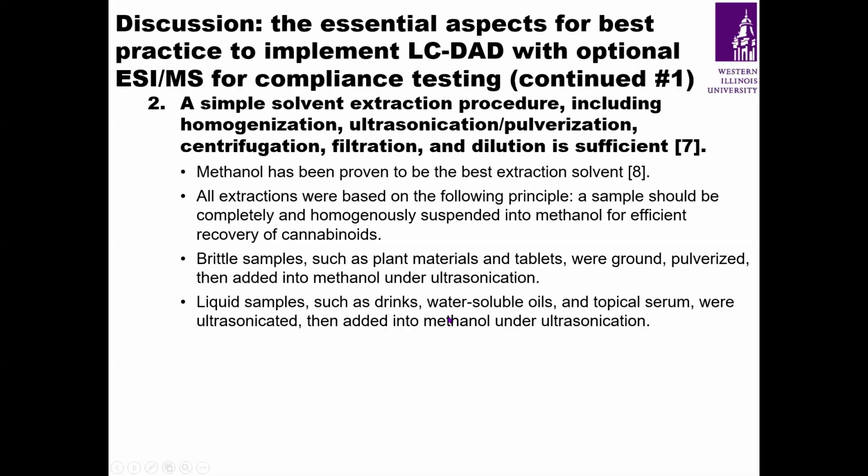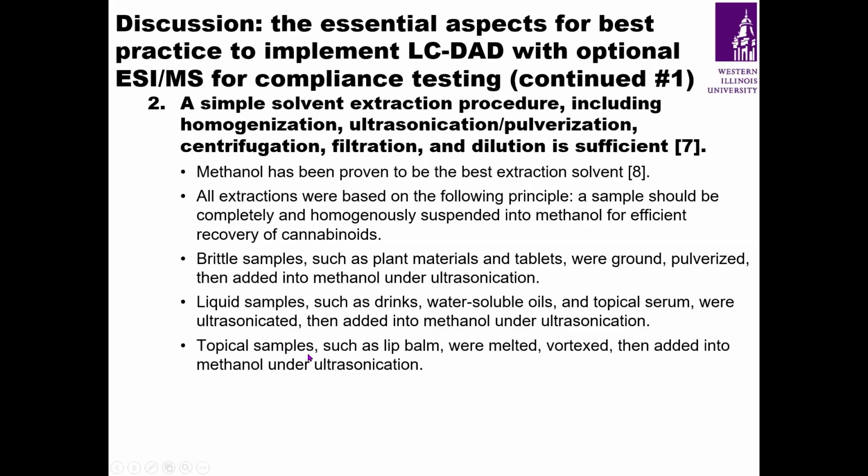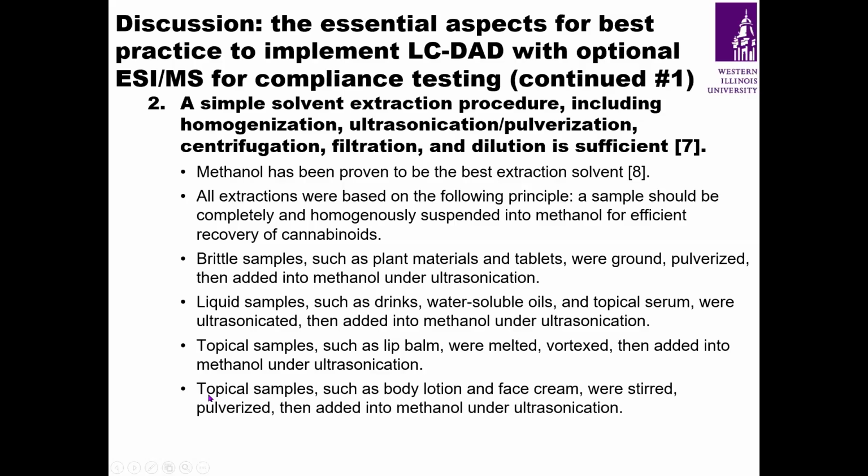Liquid samples such as drinks, water-soluble oils, and topical serum were ultrasonicated and then added into methanol under ultrasonication. Topical samples such as lip balm were melted, vortexed, and then added to methanol under ultrasonication.